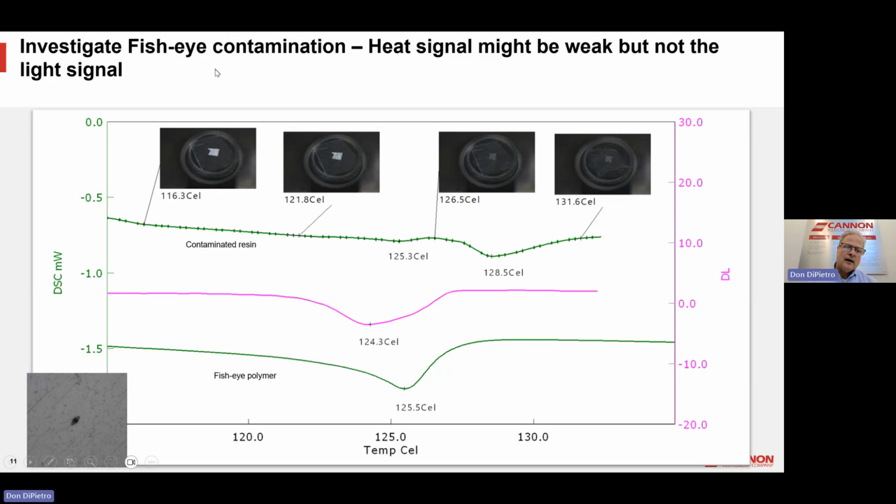And so this particular specimen, we couldn't get a lot of it, but what we're trying to measure is kind of a speck within a tiny speck, if you will. And when we run that specimen in DSC, we get the green curve. So we can kind of see something that looks fairly predictable here, but it gets a little fuzzy otherwise.